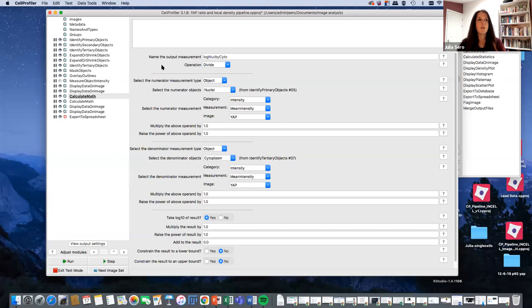Okay, so if you have exactly the same number of molecules in the nucleus as in the cytoplasm or the perinuclear region, then that ratio is going to be 1:1. Fine. If you've got twice as many molecules in the nucleus, say two in the nucleus and one in the cytoplasm, that ratio is going to be 2:1, and its value is 2. Well, what about the opposite? Say now you have twice as many in the cytoplasm as in the nucleus, so that ratio is going to be 1:2, or 0.5.